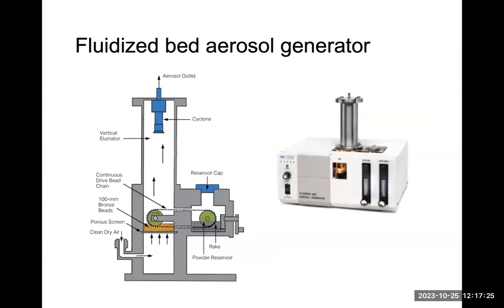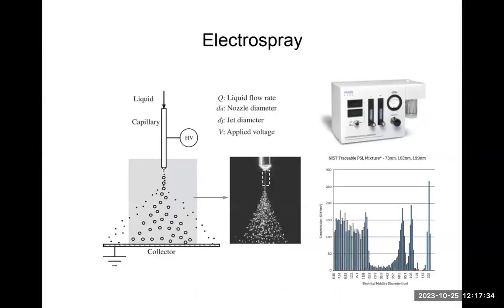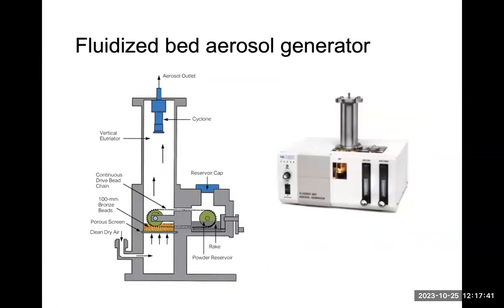So what if you want to generate non-soluble materials? We have been introducing how to generate aerosols out of a solution. What if you don't want to generate aerosols from a solution? What if you just want to suspend some dust or sand, and you also want to get a relatively constant output of the aerosols? This is where the fluidized bed aerosol generator came into the picture.